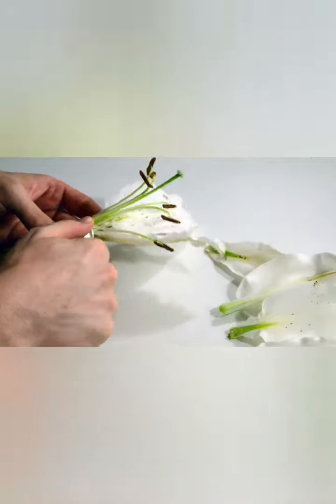We can put this onto a microscope slide and then put it under the lens to have a little closer look at it, and you'll be able to see the individual pollen grains that have been released from the anthers.